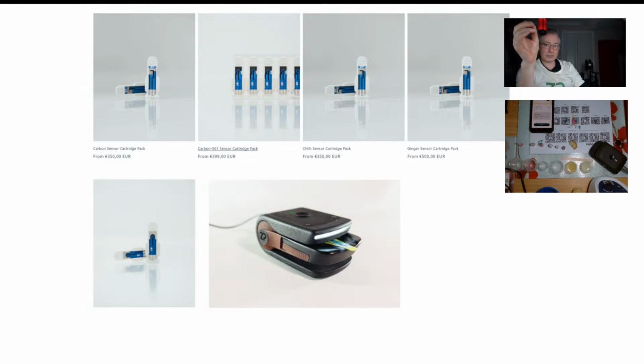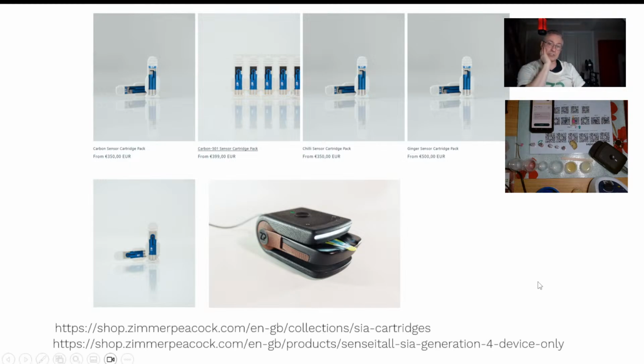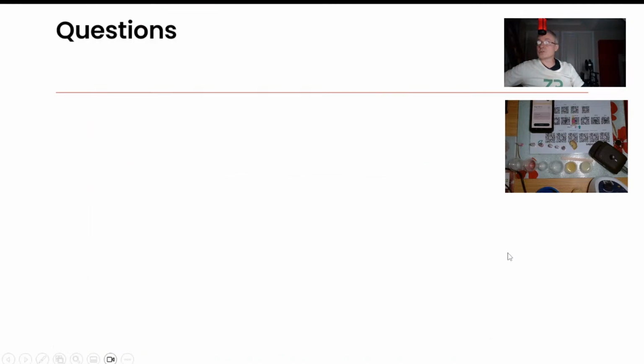Why? Because we see this as one of the best ways of translating scientific research into products. I'm going to talk about two examples this evening, one for tetracycline and one for dopamine. But I'll get to that in a bit. If you're interested in screen-printed electrodes or potentiostats, and more importantly, you're interested in translating the science out of the lab and into the real world, then please watch the rest of this webinar.